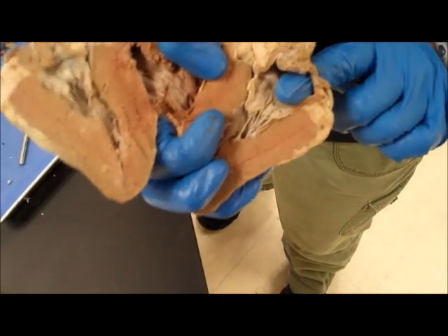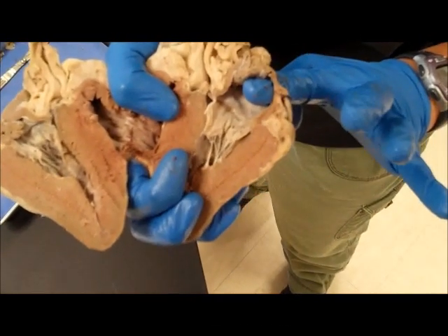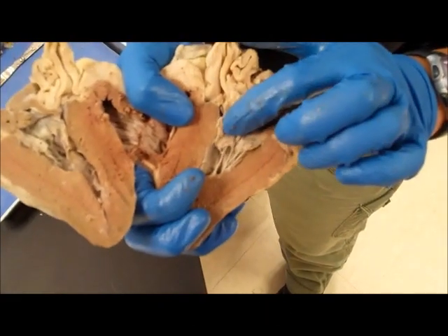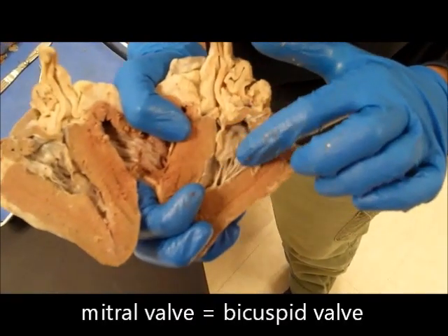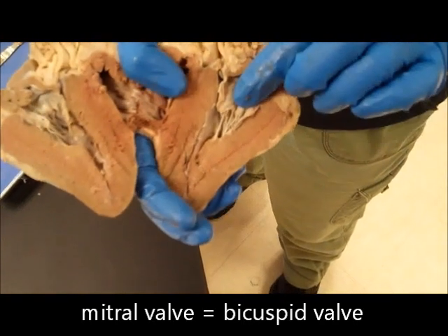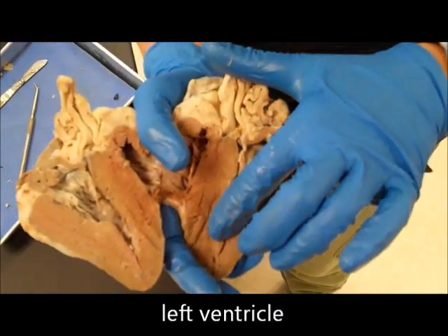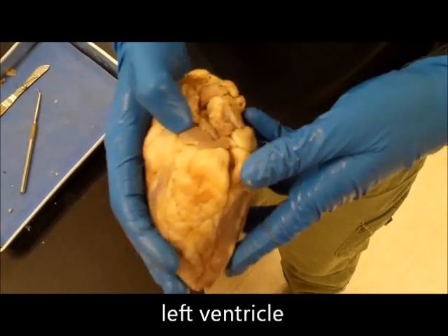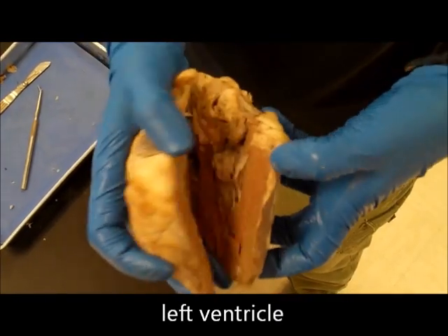It's going to pass into the left atrium, then through the mitral, also known as the bicuspid valve, into the left ventricle. Again, I'm going to close it up so you can see the left ventricle.